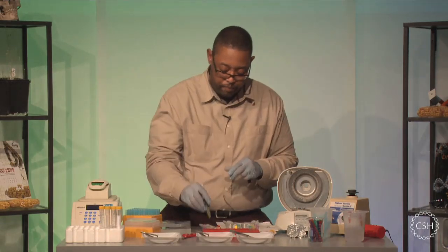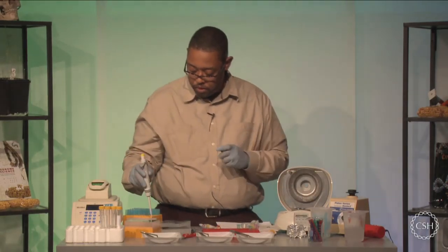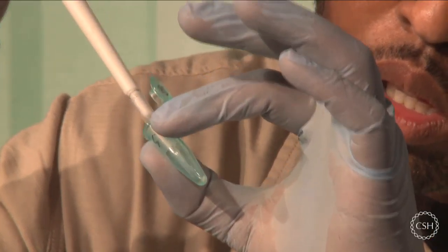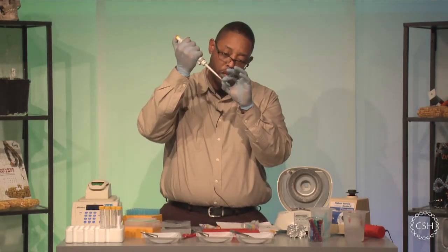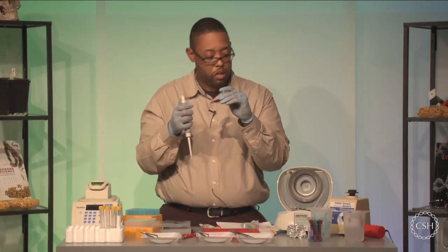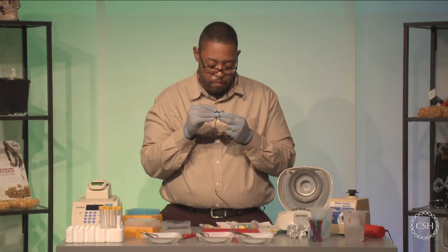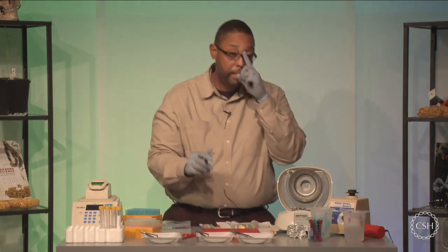And this was my meat. Finally, I'll move to the insect. And I'm just going to label that sample number 3 final, and that's my insect.